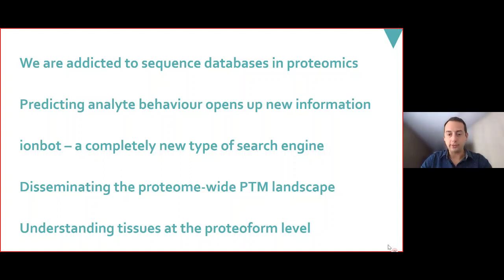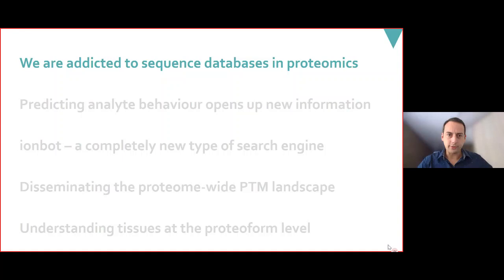This actually gives us a whole new view on the proteome, including PTMs, and we need a mechanism to make that available to the world at large. And so that is the penultimate title there, a dissemination of all of this new knowledge. And then finally, we also use some machine learning at a very high level to understand tissues at the proteoform level. So let's start with this addiction to sequence databases.